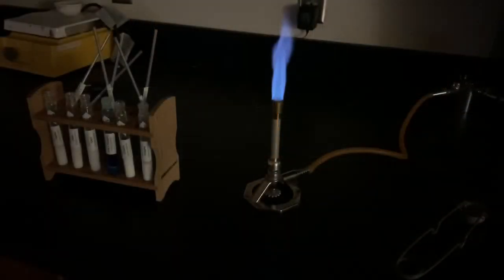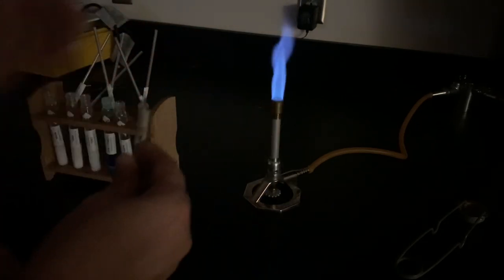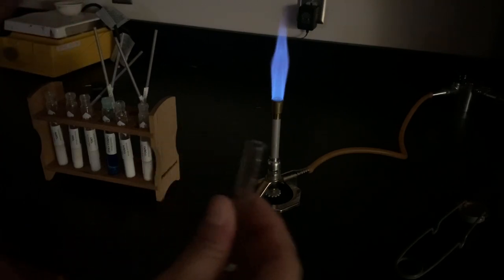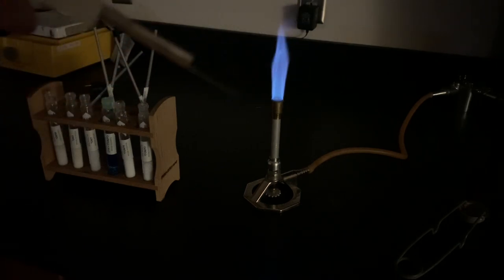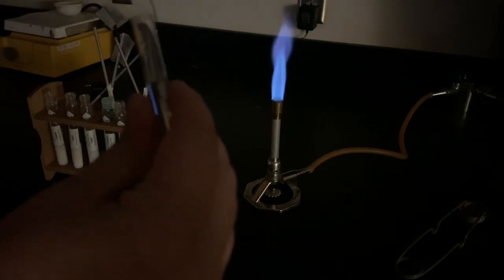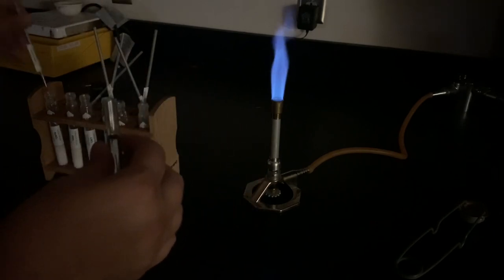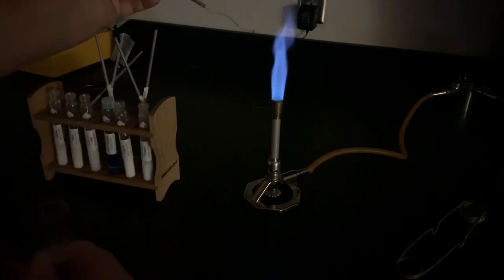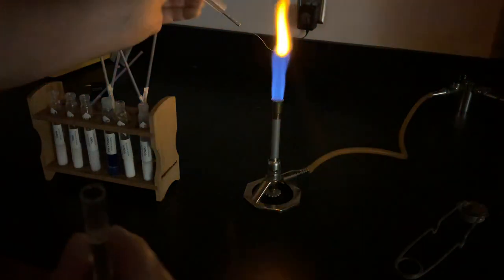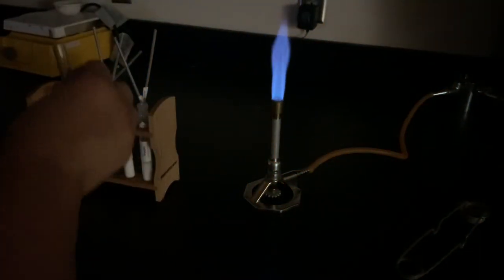To do the flame tests, I'm going to take a little test tube of clean water and stick my inoculating loop into the water to get it wet. The inoculating loop is just a little loop of metal. The first one I'm going to do is sodium — I'll get it wet, then stick it into my sodium nitrate salt, and hold it into the flame. Sodium produces a nice pretty orange color — go ahead and record your observations in your data table.